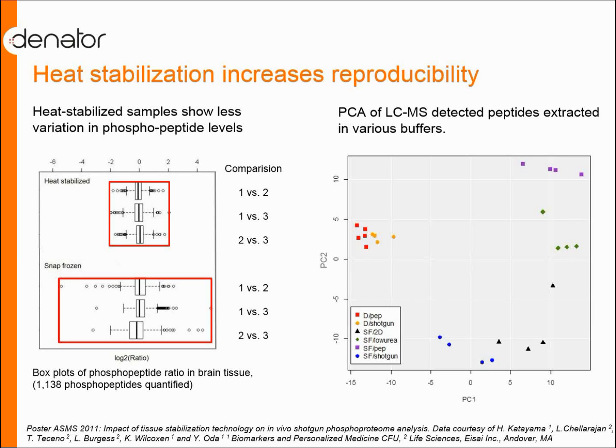Depending on the buffer, there are different classes of enzymes active. So depending on the conditions, some samples tend to move in one direction, whereas samples incubated in a different buffer tend to go in this direction. They tend to hold together, although they also spread out. This is all published in a publication from last year.